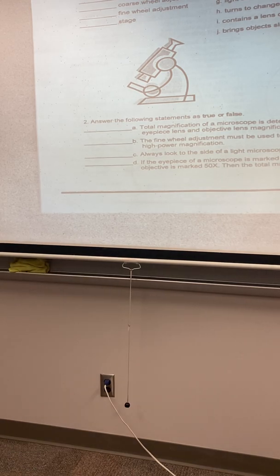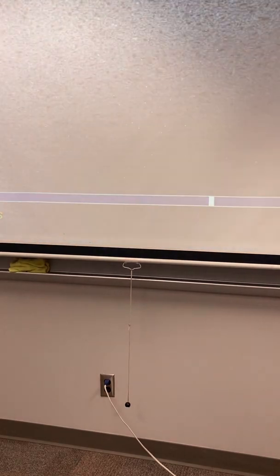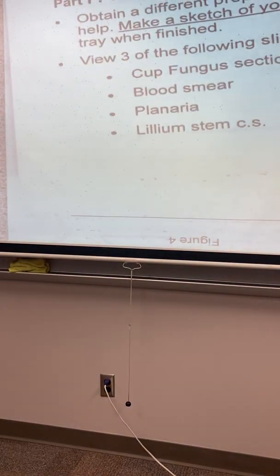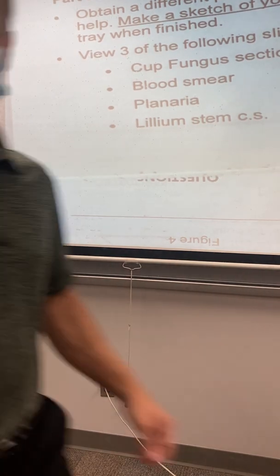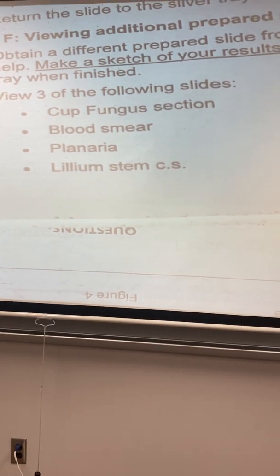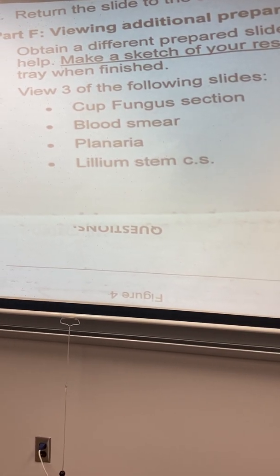Let me put that list back up there again. Make sure everybody at home can see it. There are the things that we're going to look at in lab today. You can pick any of those that you like. Pick out at least 3 of those to look at today. Maybe we'll get through 4, we might have time. And then we're going to come back up and do the quiz.